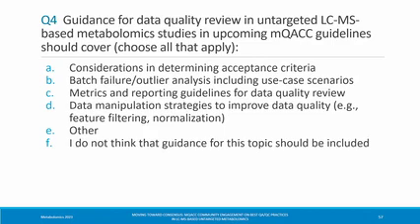Here we go. We got a microphone on its way. Thank you. I guess it can be a combination of the three ways that we have seen so far. So both checking the internal standards, the reference materials, and the pool quality controls, and try to combine these three ways. I just wrote a research grant about this, and I wrote that I will do it in this way. So hopefully it can be a way. Good.